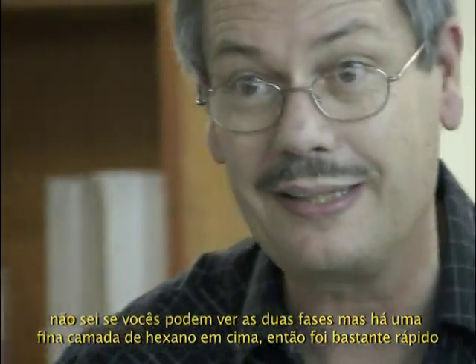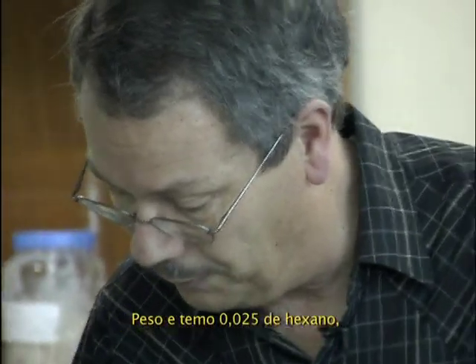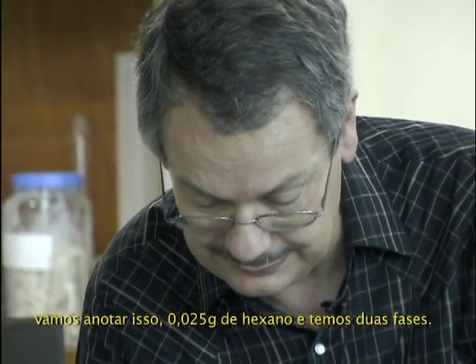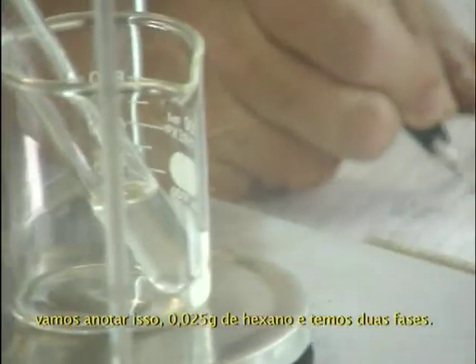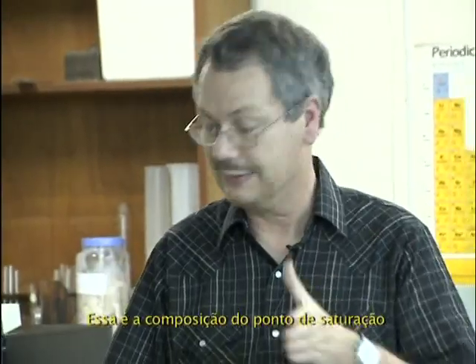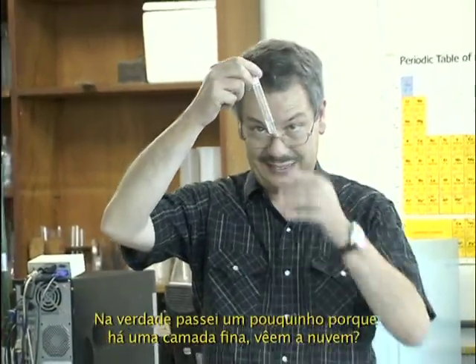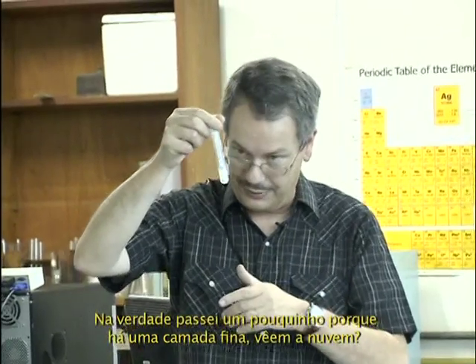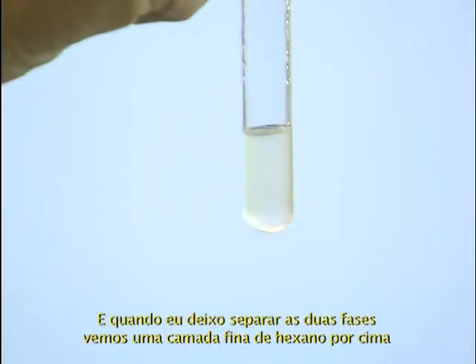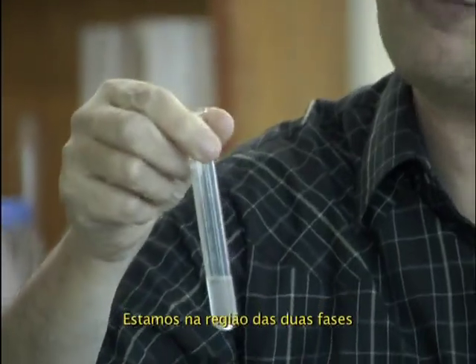So that was really quick. I waited, and we have 0.025 of hexane. So I write this down: 0.025 gram of hexane makes two phases. So this is the binodal composition, and actually I even passed it a little bit because I have a thin layer. See the cloud? And when I let it separate, you see a thin layer of hexane at the top. So we are in the biphasic area.